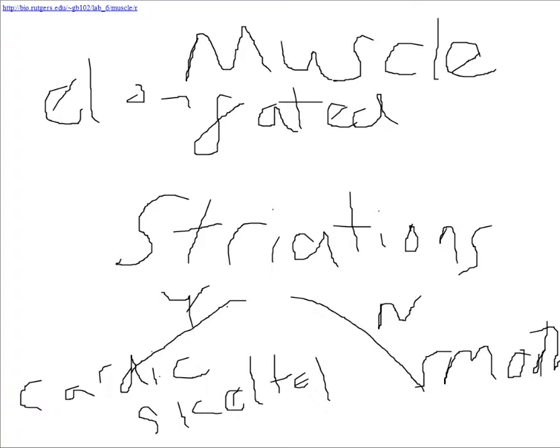Muscular tissue. So here I pulled up another image with three types of muscle tissue again, and I think the striations and intercalated discs are a little less pronounced in this, so as you distinguish muscle, it's good to be aware of the shape or the location of the nuclei as well. So that's the next feature we'll focus on.